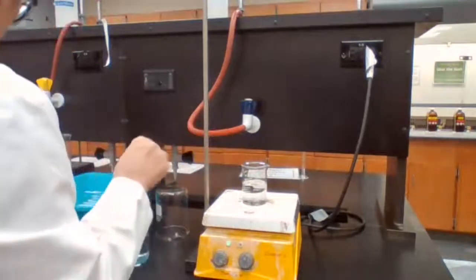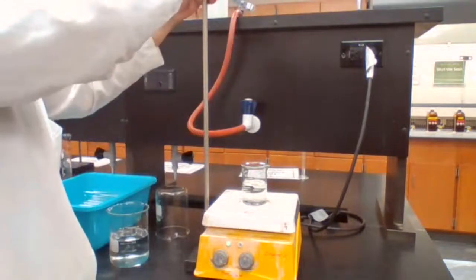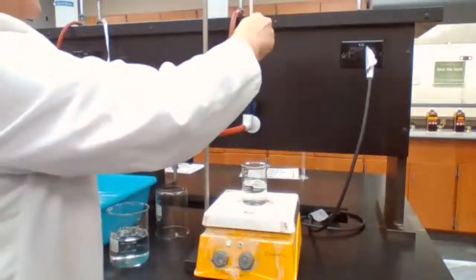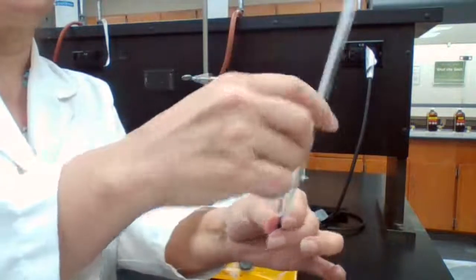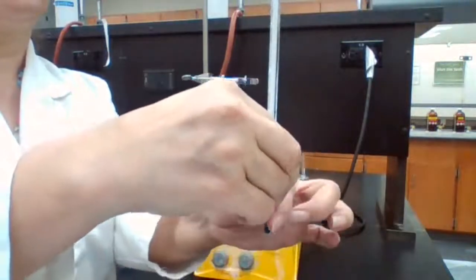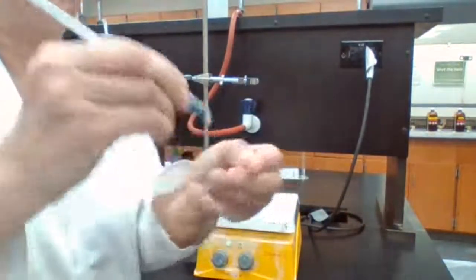Okay, we have the water boiling. We are going to use a thermometer, and a thermometer clamp to hold the thermometer. The sample is going to be placed in a seal tube. These are like small, tiny test tubes. I'm going to attach it to the thermometer, keeping it at the level of the thermometer bulb, like this. You're going to use a rubber band to hold the two together.